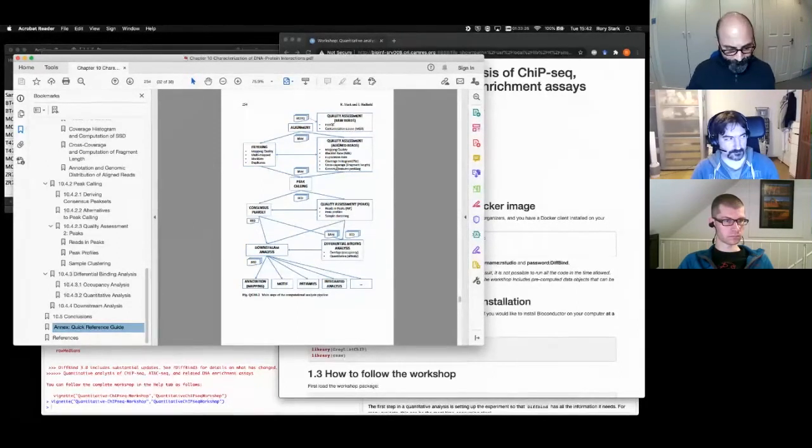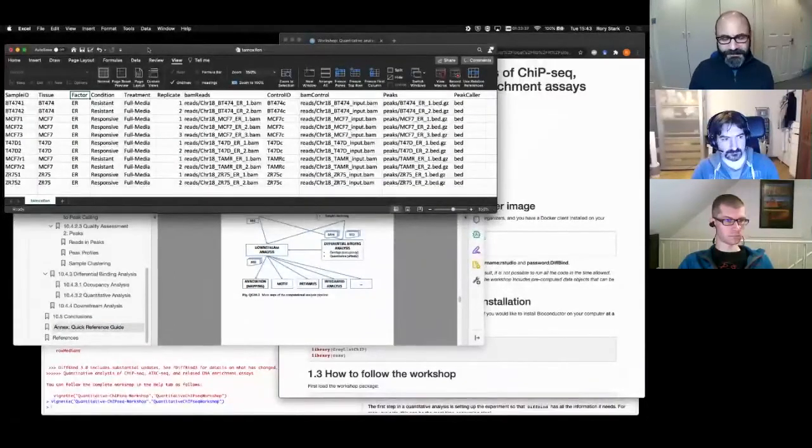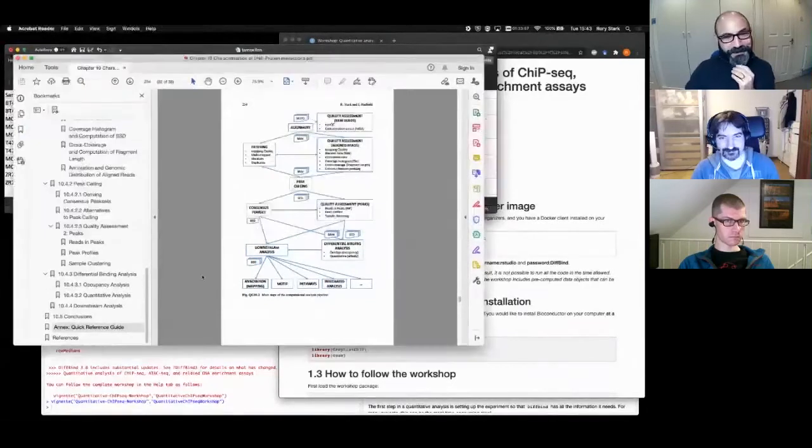interpretation at the end. For most people, the hardest part about doing the analysis is actually setting up the experimental data in a sample sheet. So people spend time getting all your data in the right place, all organized, with all the metadata captured in one place. Once that's done, you can actually run an analysis in one step. But if you haven't, then you won't be able to.